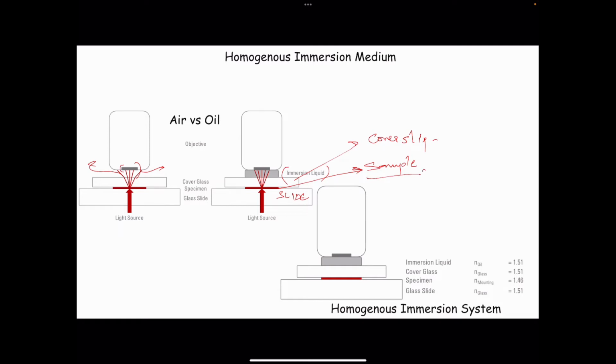So here, when your light is illuminating your sample, the refraction or the deviation of the light from the path also depends on the refractive index of your sample. Now fluorescence microscopy techniques present us with a wide variety of challenges. For example, in conventional and confocal microscopy, we can identify three broad classes of specimen. It can be animal, plants or bacterial cells.